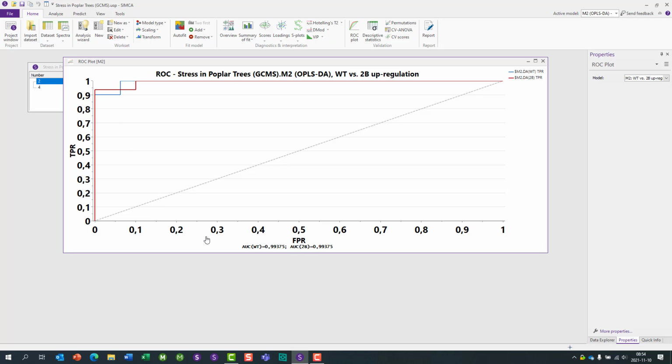A quantitative measure of the capability of the binary classifier is provided by the area under the curve measurement. The closer to 1, the better the classifier. If the area under the curve would be 0.5, that would correspond to the curve for the ROC function aligning close to the dashed 1, 1 line, and then you would have a classifier performing on average.